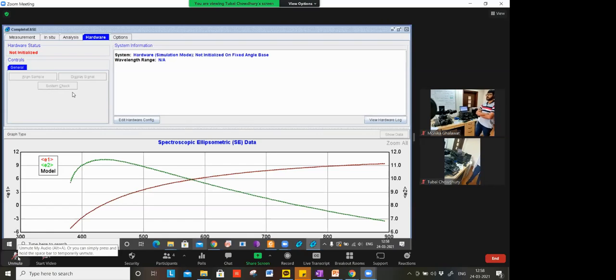Yeah, I will show you, but it's not like that. We will get different parameters in this software and different parameters in that software. They both are from the same company. It's just the updated software. Yeah, still, I will show you, that will be helpful. No issues there. I can understand fitting is very different in different environments. I just want to see what different parameters we are getting through this. So that's it. No issues with that. Okay, I'm not getting you. Yeah, they both are same software. I will show you what you want.